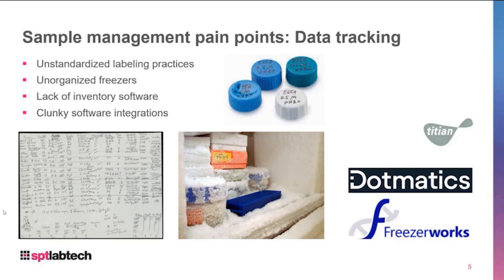But I know that one thing we recommend on top of automation-friendly tubes is a software product for inventory management, because it's oftentimes a bit of a secondary thought to sample registry in an organization.